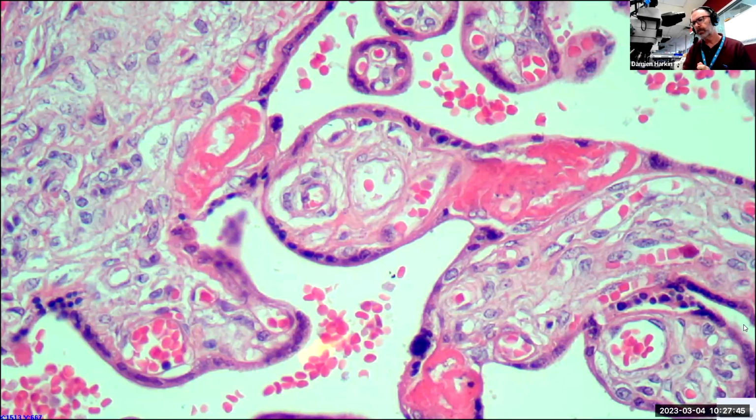It was subsequently shown to be formalin pigment, because with the appropriate treatment, it was then removed. So yes, it may be something that is often found associated with areas where there are red blood cells, but it's always best to do the test to be sure. It just reminds us of that principle that even with experience, you may think you know what you're looking at, but it is always safer to perform either the solubility test or the bleaching step or the reaction in order to be absolutely certain.